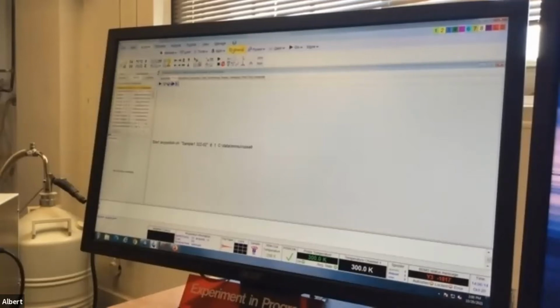It did move in. I don't know why it's not sweeping. I'm not sure, but it's just not showing. But it is shimming. And again, bottom left corner, that's where all your commands and everything is happening. So when you look down there, if it says it's done, that's when you know that it's done.